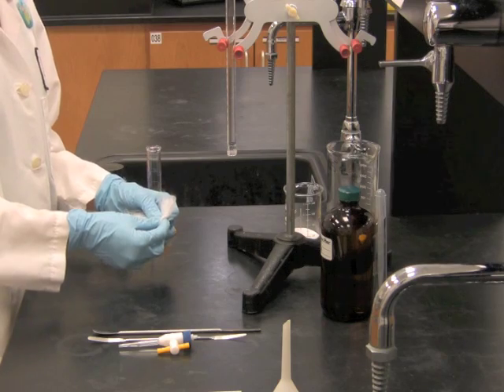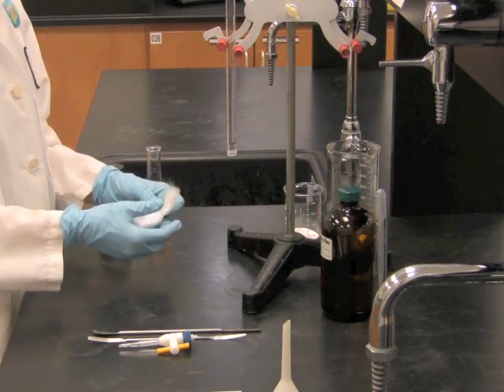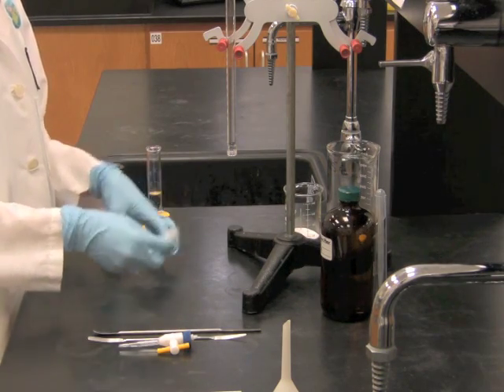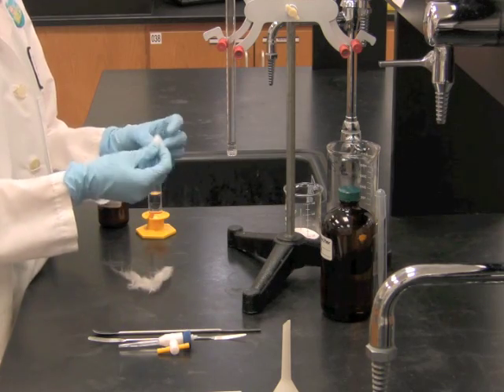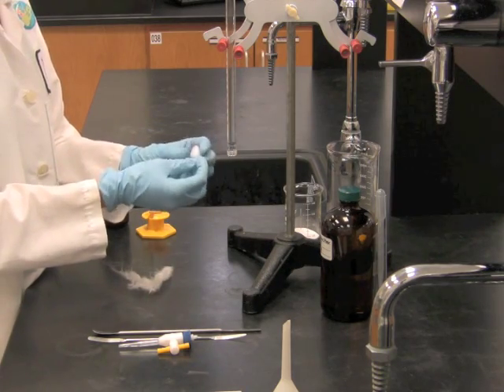While our sample is evaporating in the hood, we're going to prepare our column. First, we'll take a piece of glass wool and make a small plug to put in the bottom of a dry column.